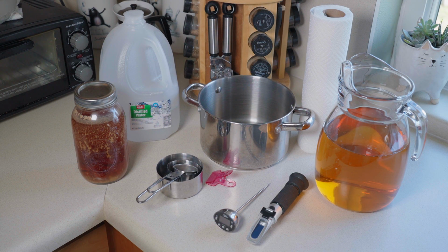Hey everybody, I've been using my refractometer more and more throughout my brew day, especially in the mash where I want to track the gravity readings as the mash progresses. And I got to thinking, how well is this ATC feature of the refractometer working? So I thought I would do a little bit of a deeper dive into different readings at different temperatures with the same wort. This is the equipment I'll be using today.